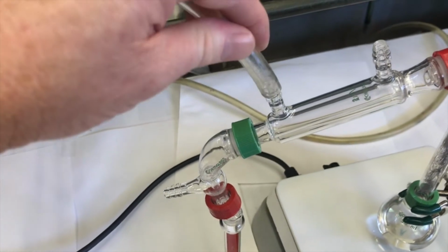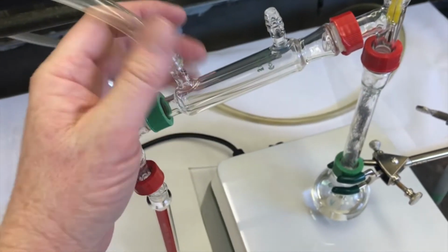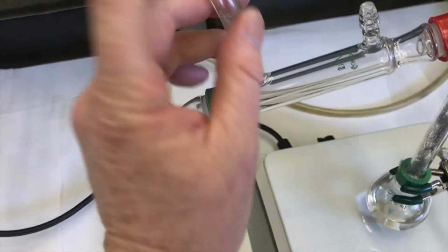I want it to enter the low end so that the water will fill up the condenser and then drain out the top. If I put it at the top, the water might just fall quickly and not completely fill, and not be as good of a water condenser.